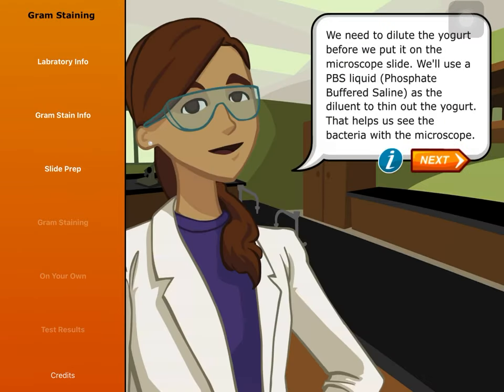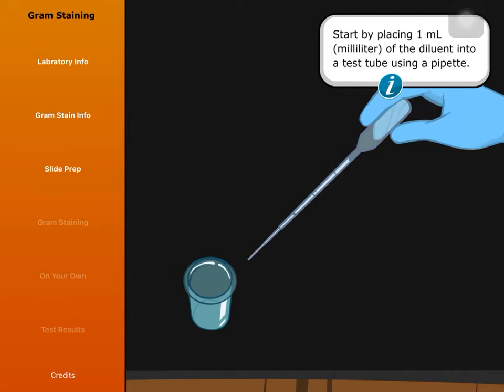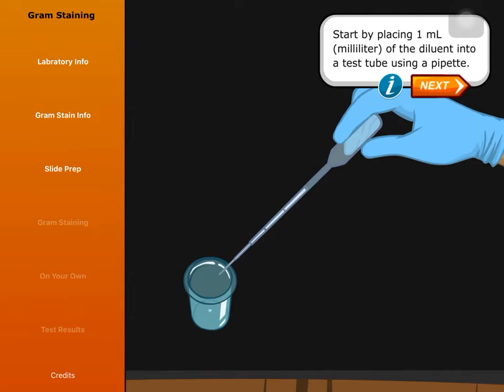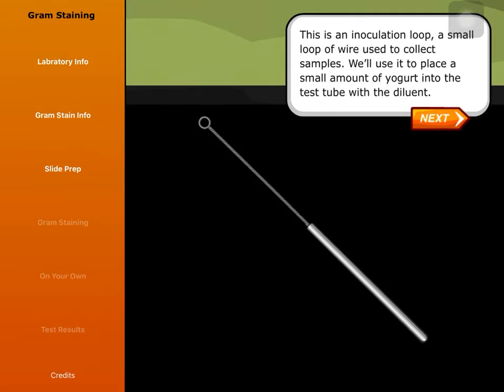We need to dilute the yogurt before we put it on the microscope slide. We'll use a PBS liquid — phosphate buffered saline — as the diluent to thin out the yogurt. That helps us see the bacteria with the microscope. Start by placing one milliliter of the diluent into a test tube using a pipette. This is an inoculation loop, a small loop of wire used to collect samples. We'll use it to place a small amount of yogurt into the test tube with the diluent.